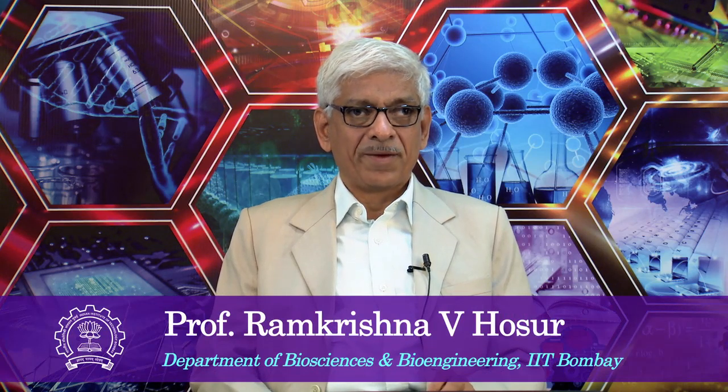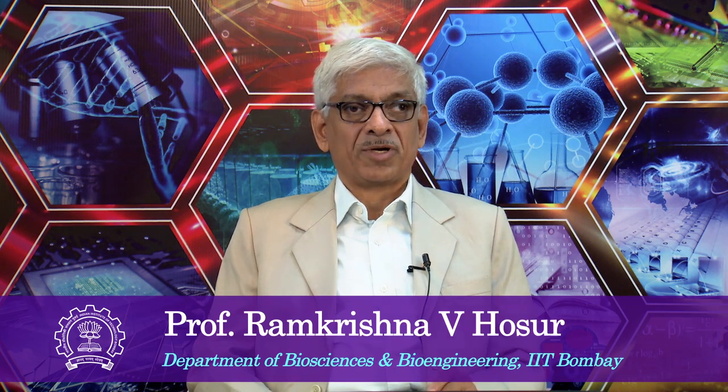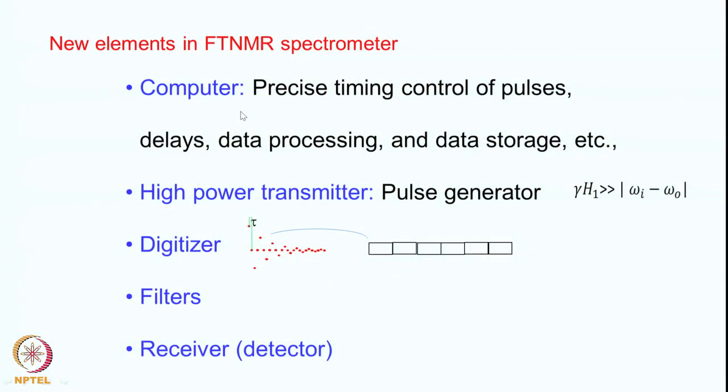Let us continue with the discussion of the FT-NMR spectrometer we introduced in the last class. So just to have a recap, I have some summary of this FT-NMR spectrometer in this slide. The new elements in the FT-NMR spectrometer, first thing is the computer, because everything is computer controlled now. Now we have to be precise with respect to the timing of the pulses, the control of the pulses and the various other aspects of the pulses, as we will see many times in due course.